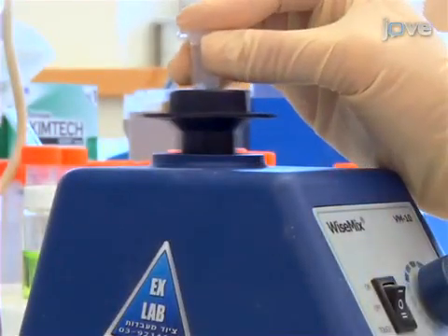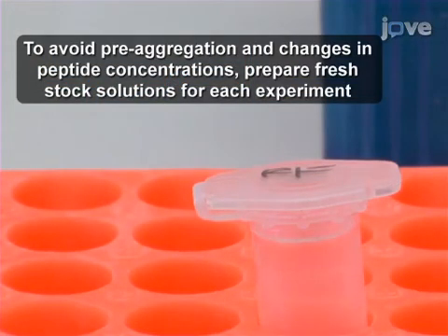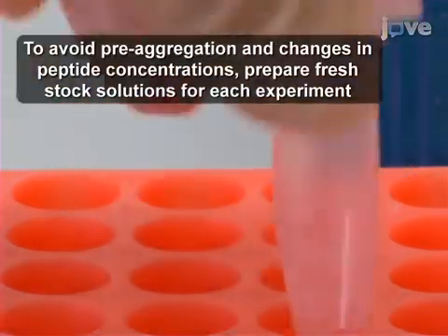mix it with a vortex mixer for a few seconds and set it aside on the bench for a few minutes until the peptide is completely dissolved and the solution is clear. Then dilute the peptide stock.